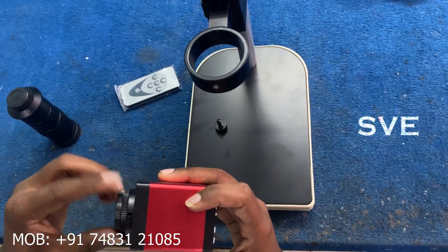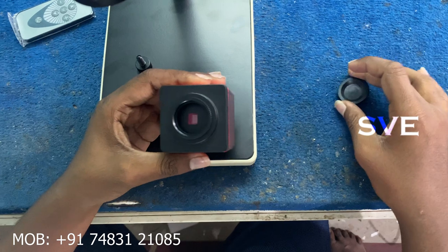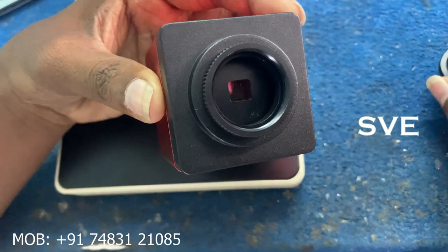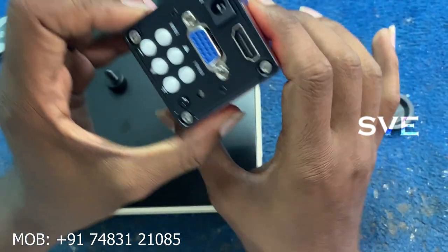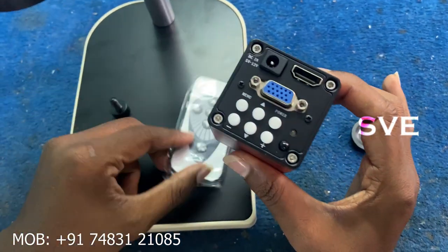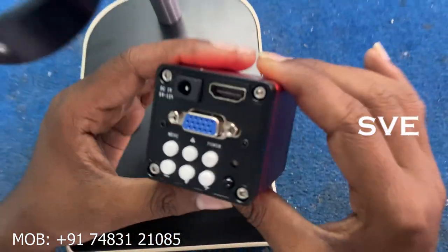Next, here is our microscope camera. Let's see how it looks. As you can see, this is the main microscope camera. Have a look here. And this is the top side of the microscope camera. And this is its remote.